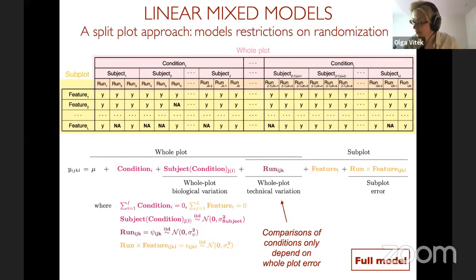How does your structure account for sample fractions? Okay, this is a really good question. So we do work with fractions. So in this case, you can say, okay, we have the first two features come from fraction one and the second two features come from fraction two. So we essentially just concatenate them. So the danger, or the difficulty, is that the same feature can be present in multiple fractions. And then we need to think about how to combine this in this data structure.